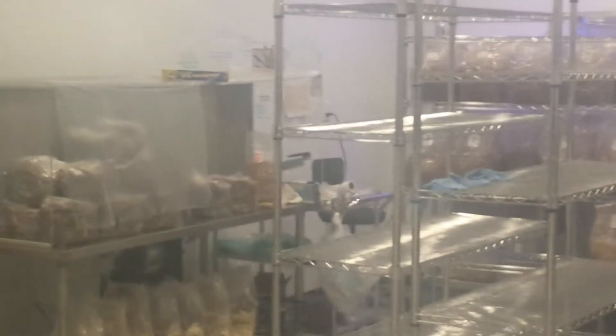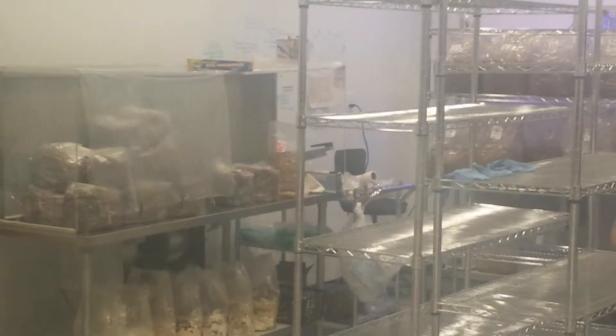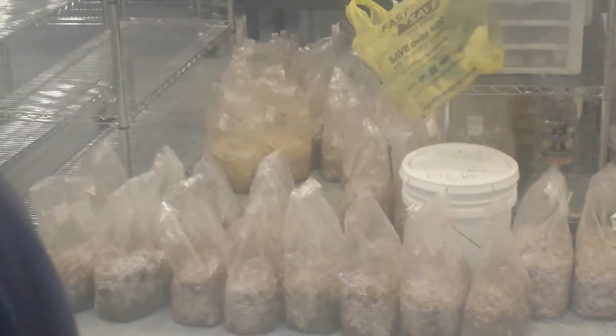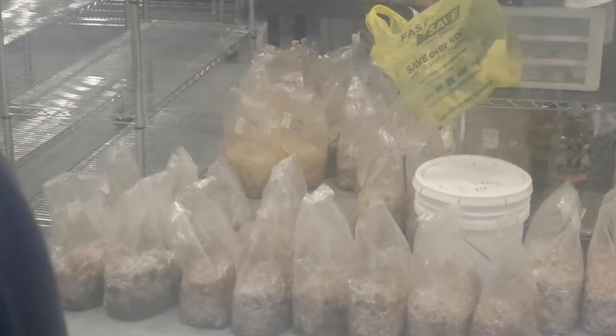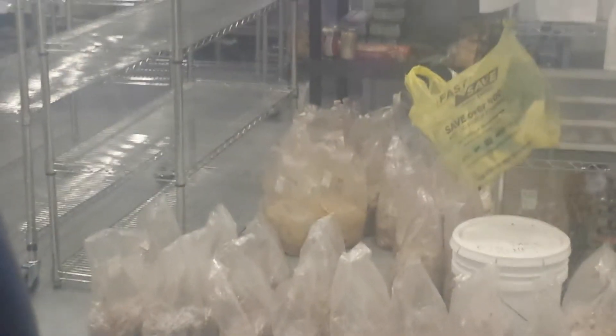Once I sterilize — I sterilize a lot of the sawdust. Remember the spawn you were using? That's where you see all these bags. All the bags on the floor are because our walk-in cooler is down the street at our house. So these are just colonized and waiting for that to be built so I can clean up the floor. This is just a way of keeping them cool.